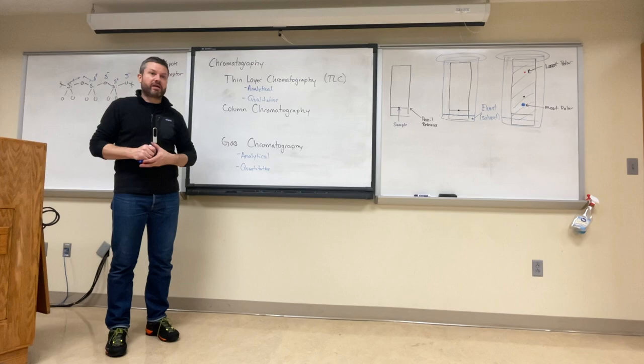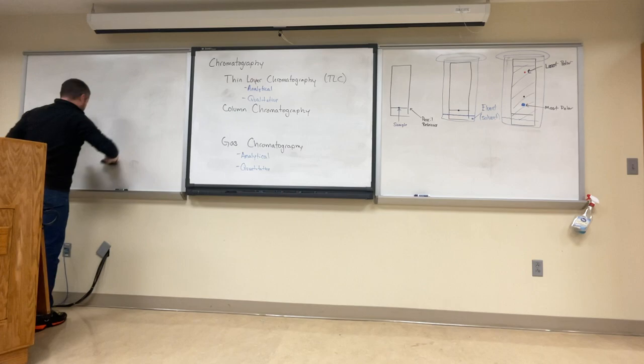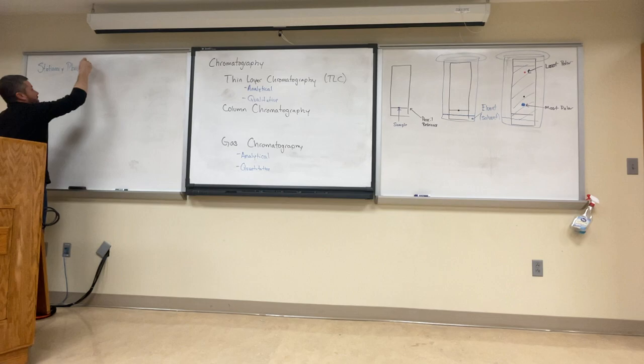But both of these work on the very same principles. So for all chromatography, you're going to need three things. You need the stationary phase. So in our case, this is the silicon oxide.